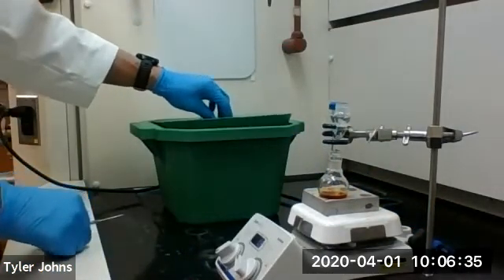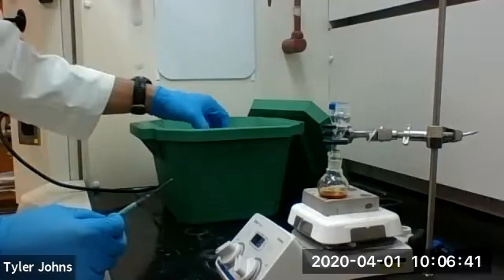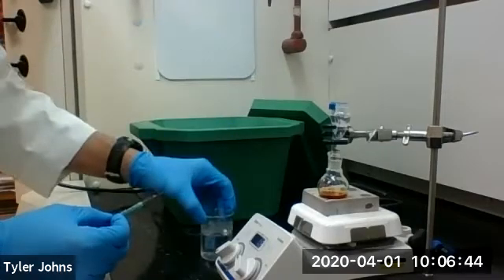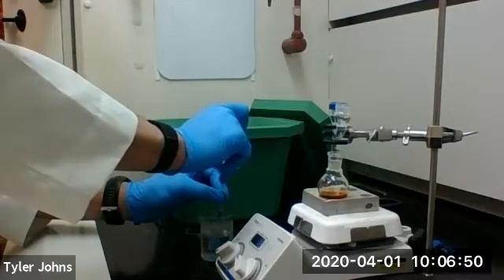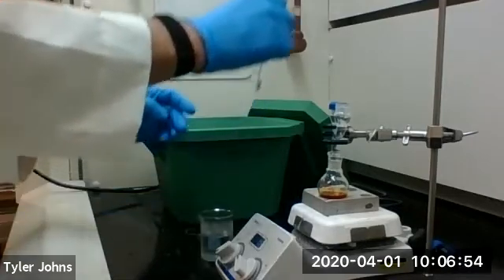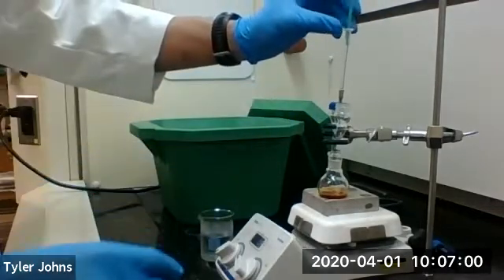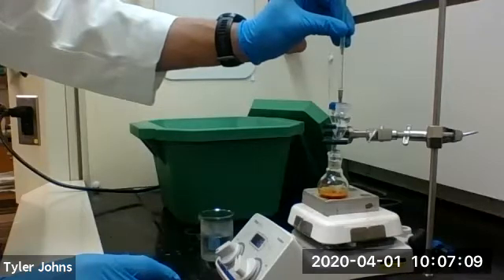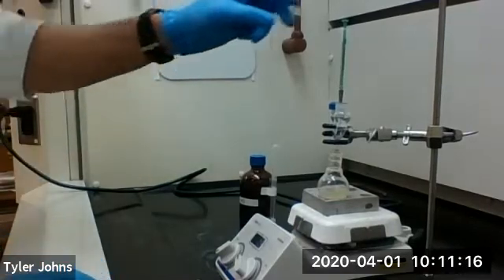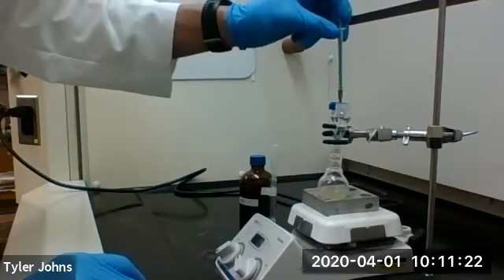Then we're going to add four milliliters of ice-cold water slowly over five minutes using our syringe. We have some ice-cold water here and we'll be adding four milliliters over about a five minute period. We've now added all four milliliters of ice-cold water over the five minute time period.